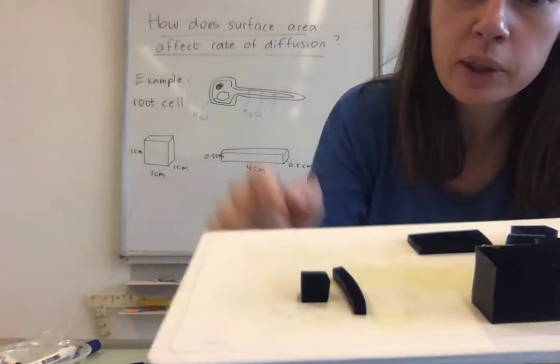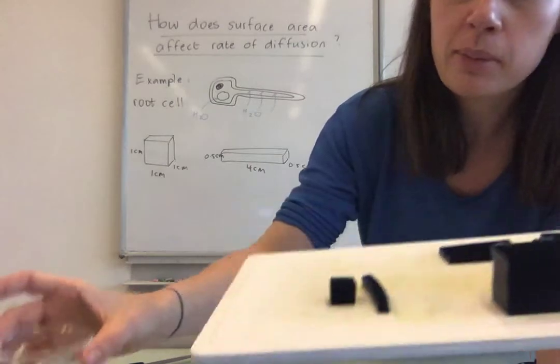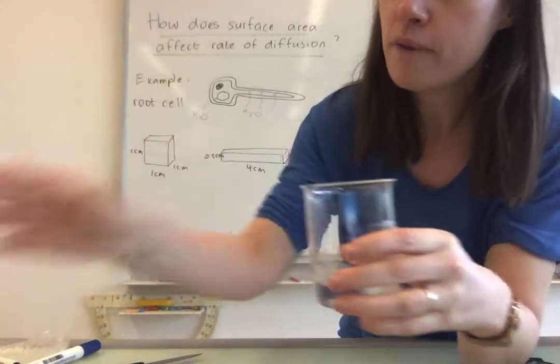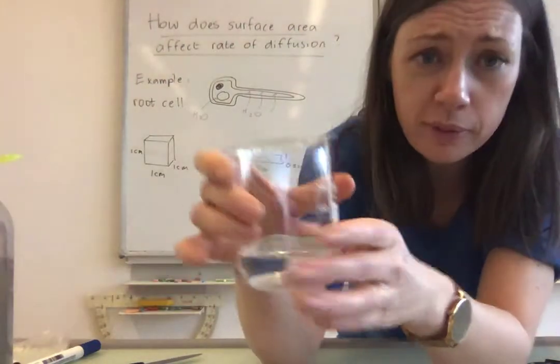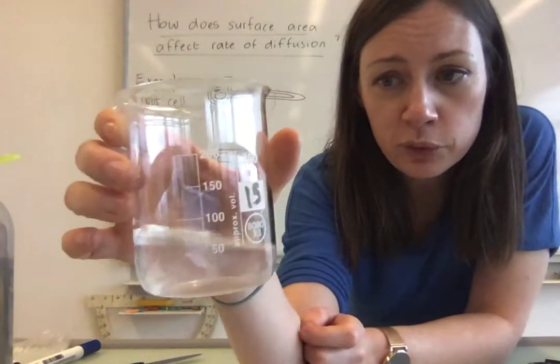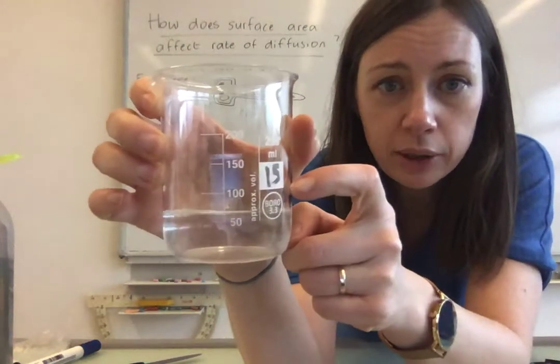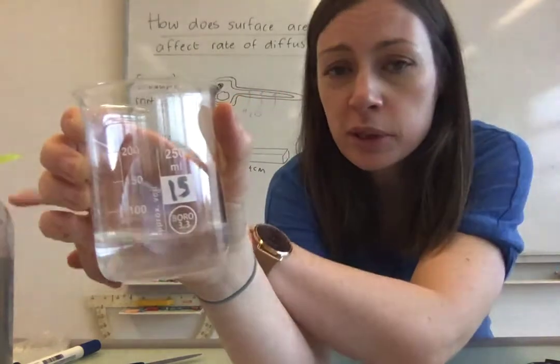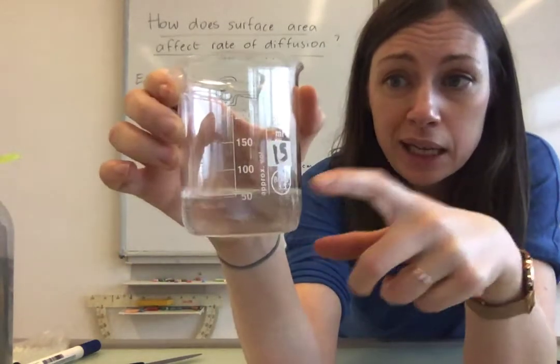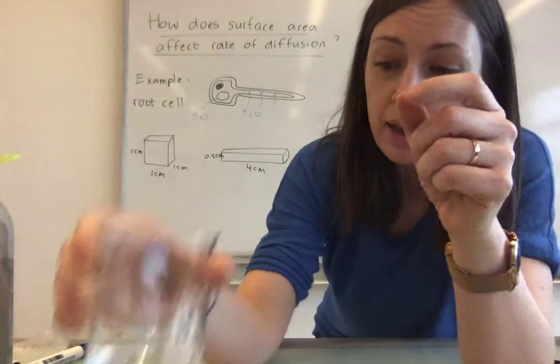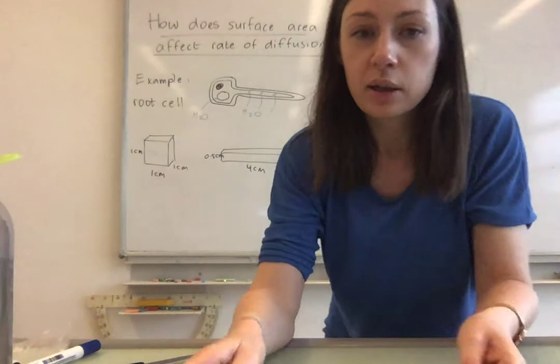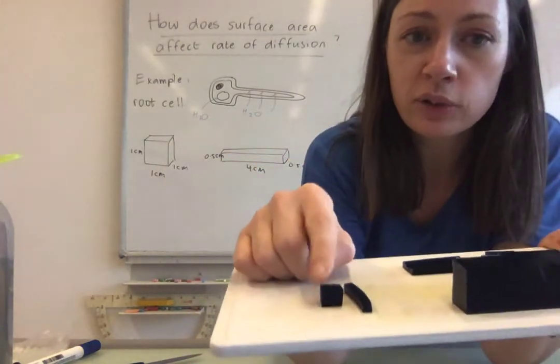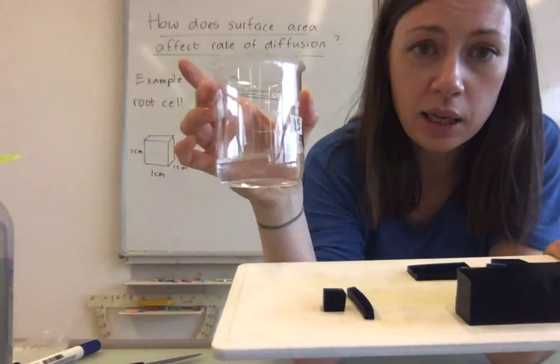Next thing that we're going to do is we're going to take these shapes and put them into some vinegar. Vinegar has got an acidic pH and we're going to put 50 centimeters cubed of vinegar in our beaker. So 50 centimeters cubed of 9.5% vinegar in this beaker here. Next thing that we're going to do is we are going to get our shapes and put them in here.